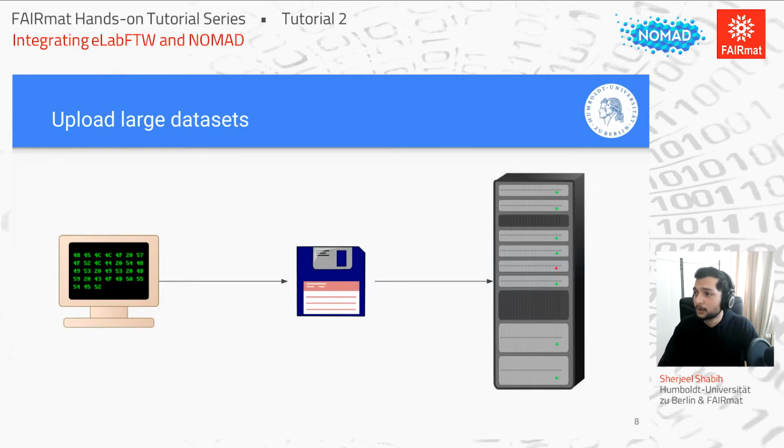And yeah, this is a major problem that we face, where we're creating data in magnitudes of 10 gigs or even more. And a lot of users in my lab had a problem where either their home connections wouldn't be fast enough and it would time out, or the RAM on our server, even though it's quite a large server, would still fail. So I implemented this new way to upload by using more modern techniques, where it streams the data instead of allocating it into RAM and then copying it. But I guess I wouldn't get into the technical details. It just means that you can upload relatively larger data than what eLabFTW was doing before.